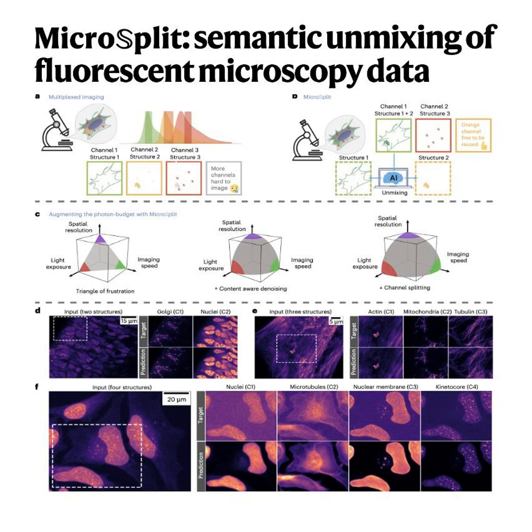It does. So stepping back and synthesizing this whole journey, we started with the rigid physical limits of light, right? The photon budget and the triangle of frustration have dictated the pace of microscopy for decades. They really have. But by combining variational splitting encoder-decoders, basically blending lateral contextualization with massive unsupervised denoising, we now have a system that can semantically unmix biology. We can map uncertainty with posterior sampling, match the accuracy of human experts, and drastically reduce the light needed to see the invisible. As long as we respect the boundaries of structural similarity and absolute intensity, of course.